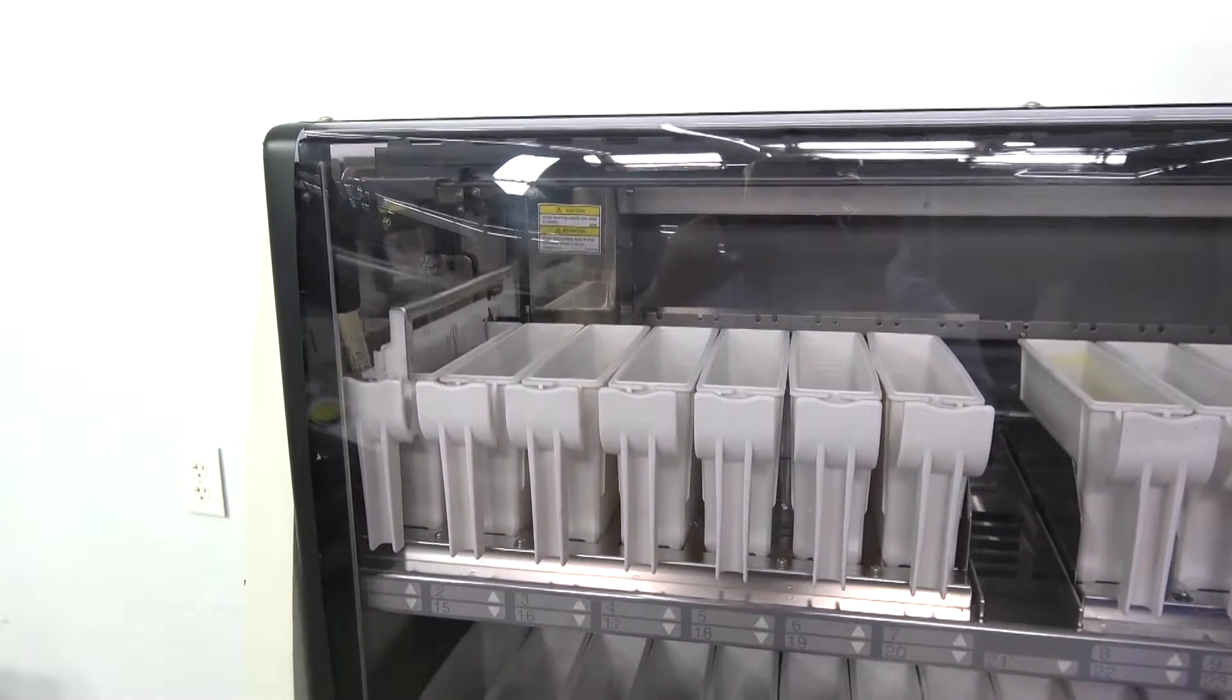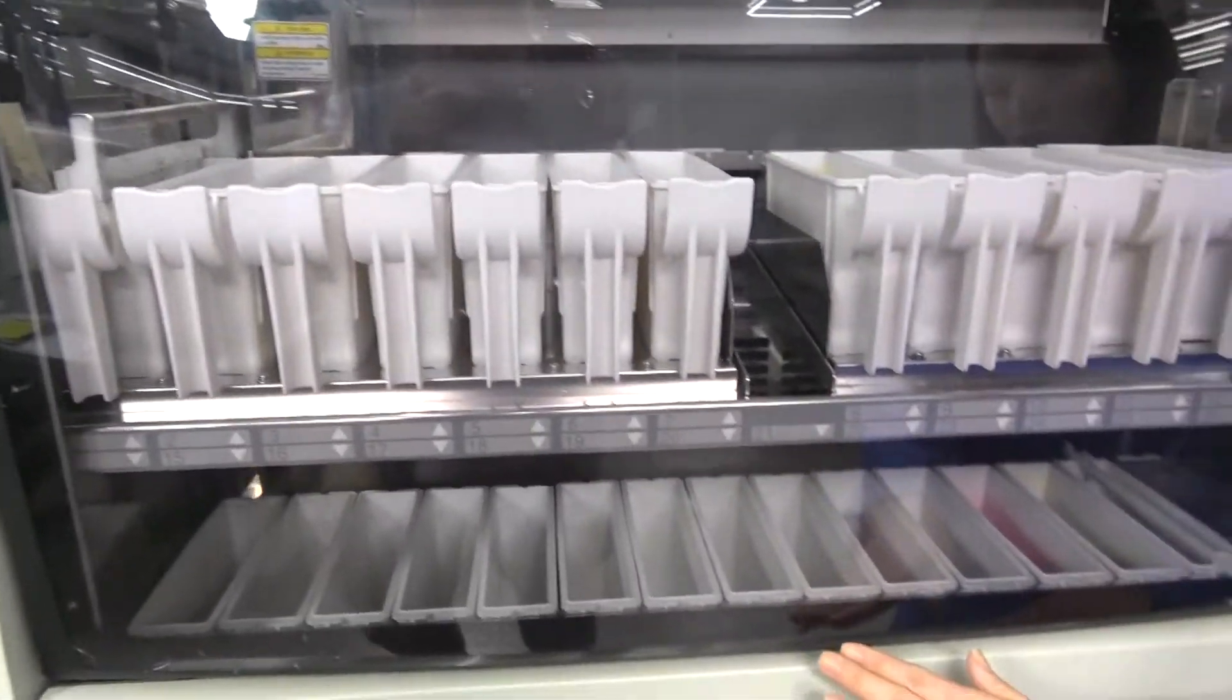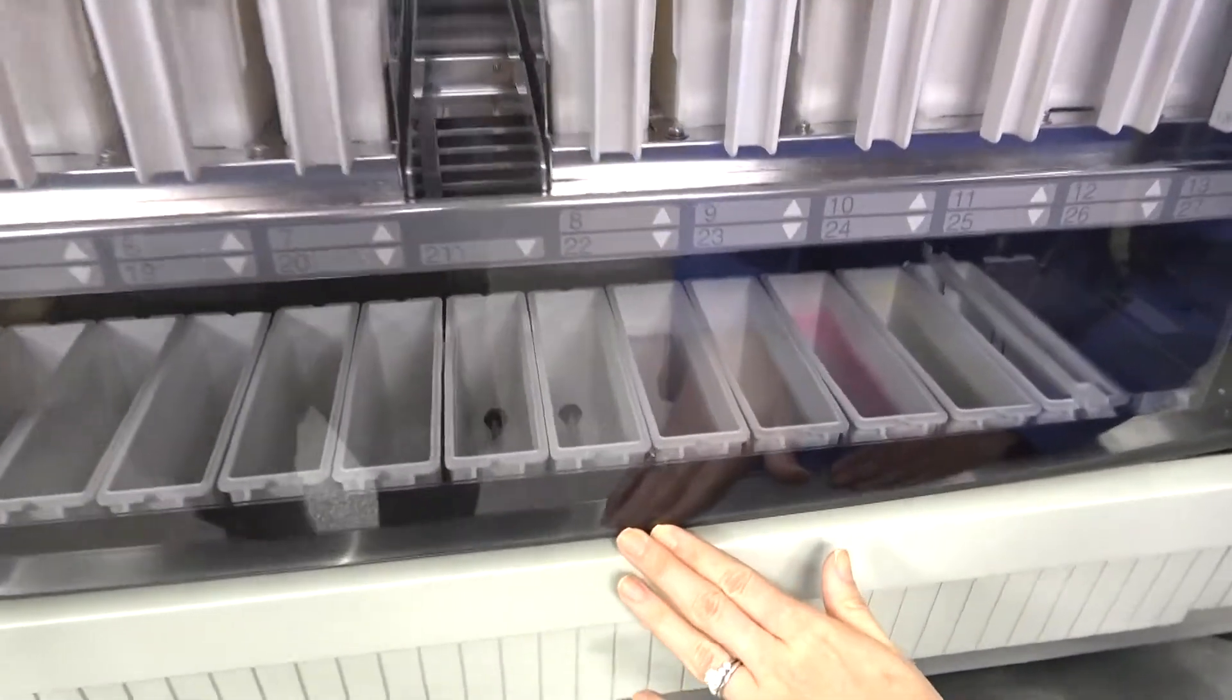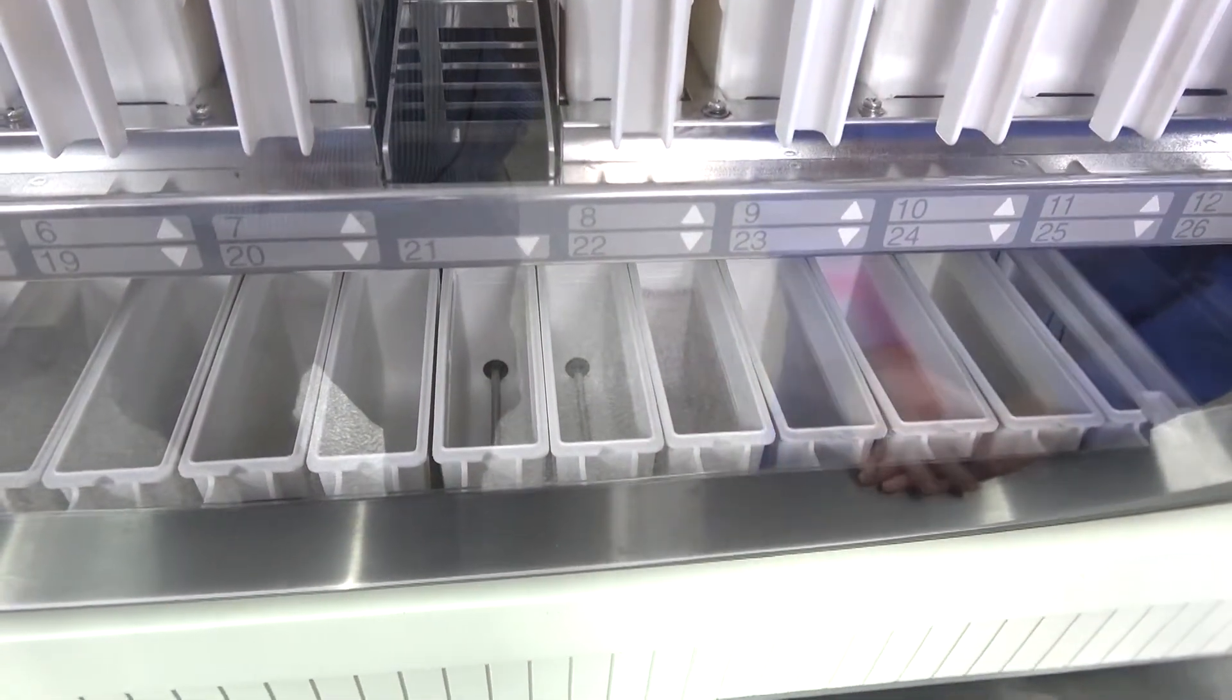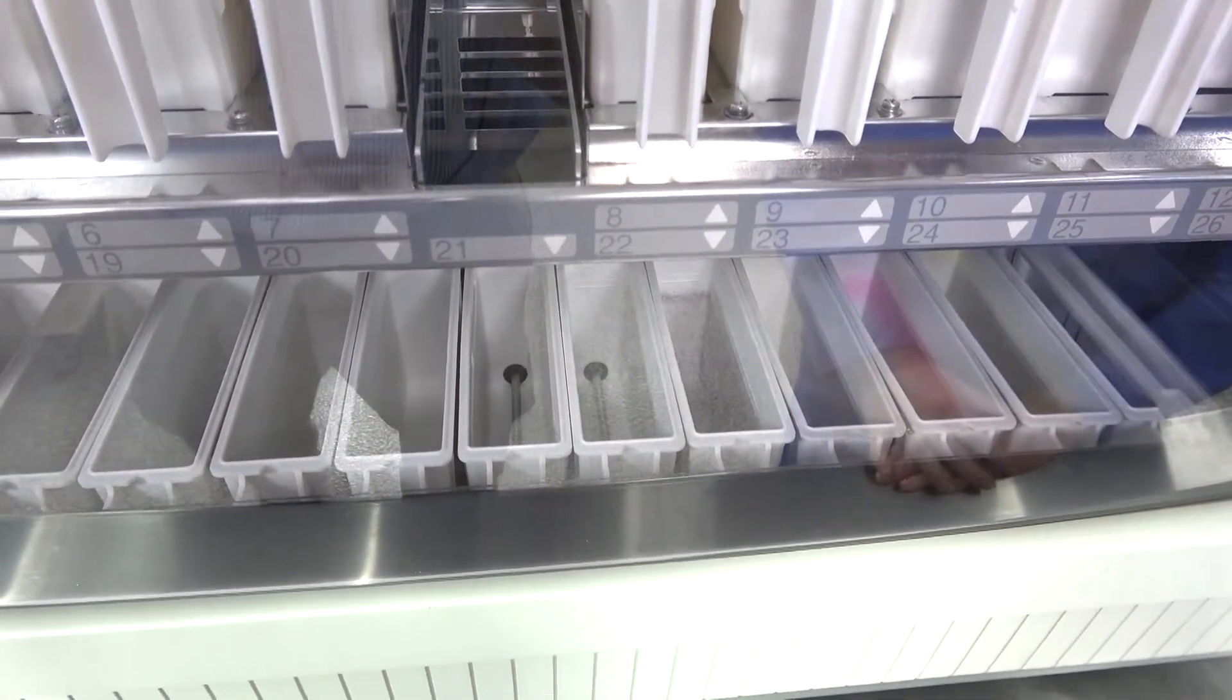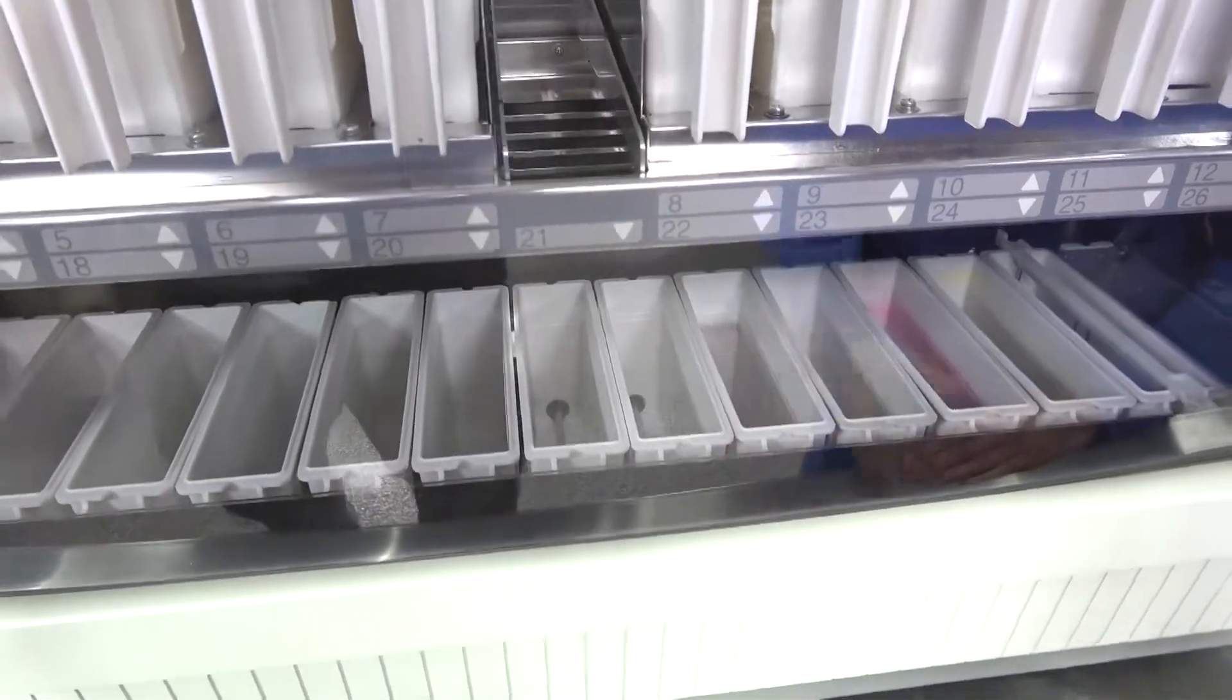So as you'll notice here down at the bottom there are two wash buckets that are hooked up. Now these automatically fill with water. You can see in the back there the lines hooked up so the water can fill automatically.